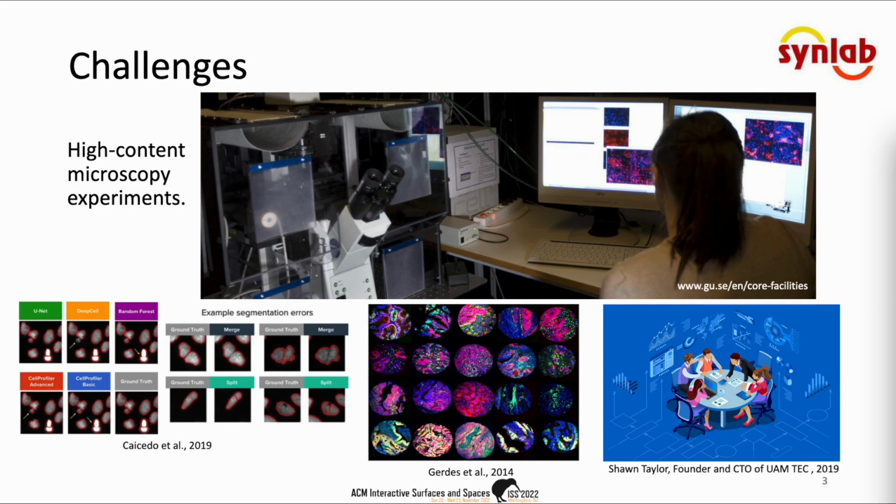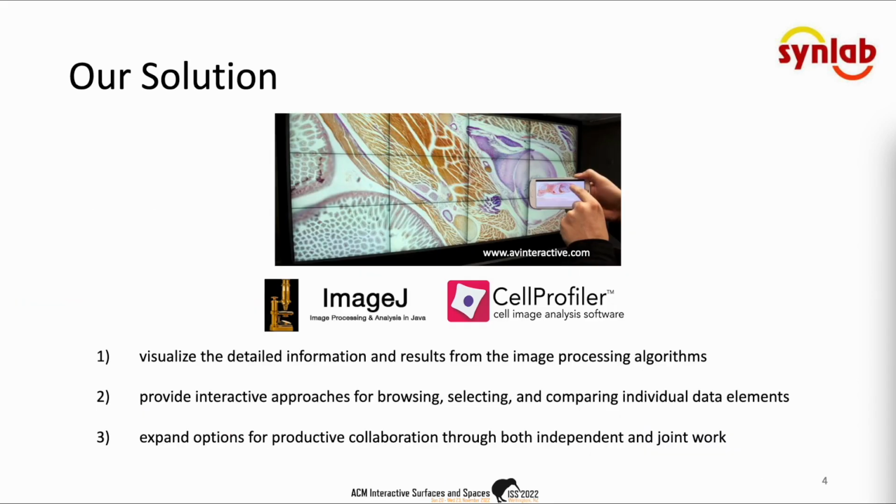biologically important events. Another challenge is the lack of methods for biologists to track and monitor unique events and to find and assess the impact of pattern variation. Lastly, the current approaches in this area don't allow for collaboration, exploration, and interpretation, even though the data is typically analyzed by teams of researchers working together.